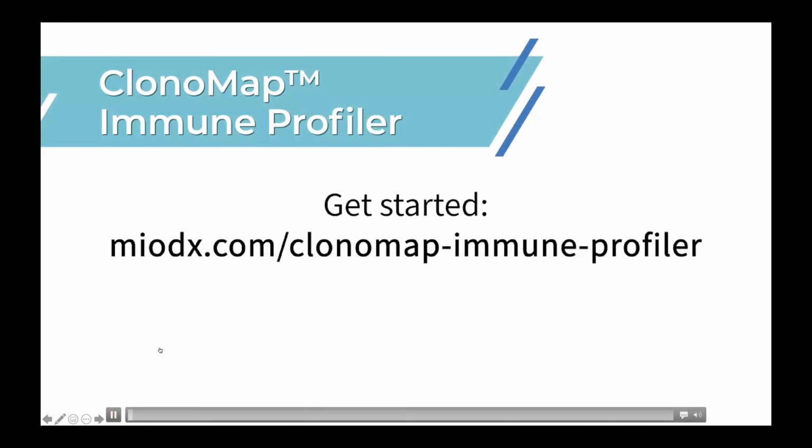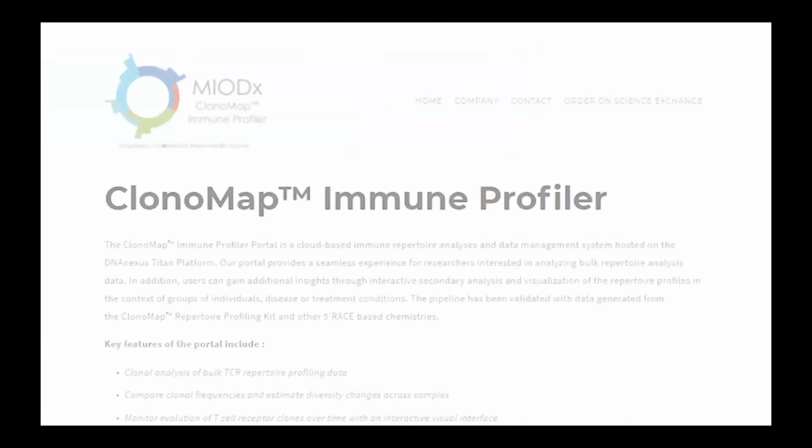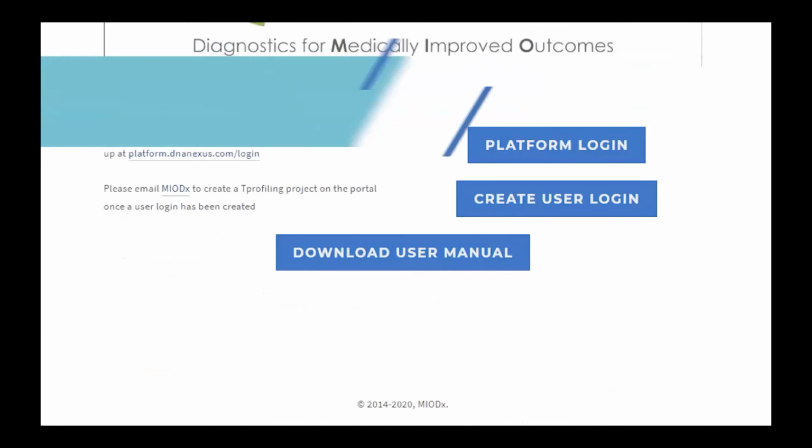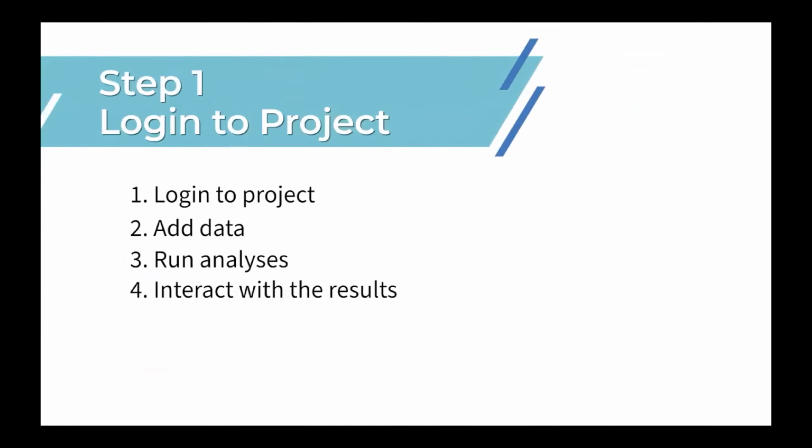It can be accessed through our web page. And for that, you need to create a login for DNA Nexus, as I mentioned previously.